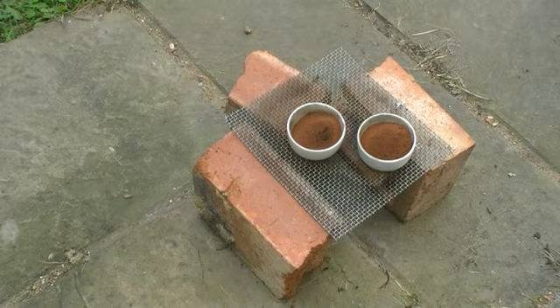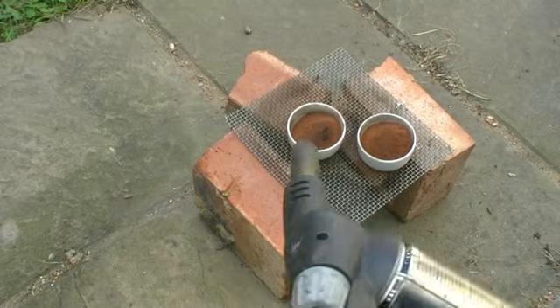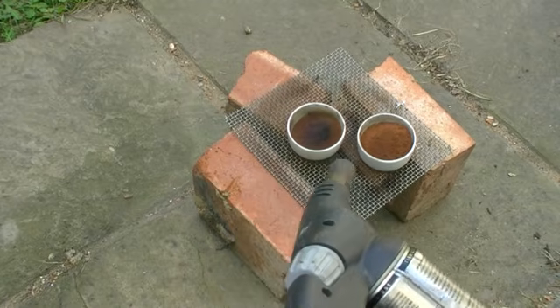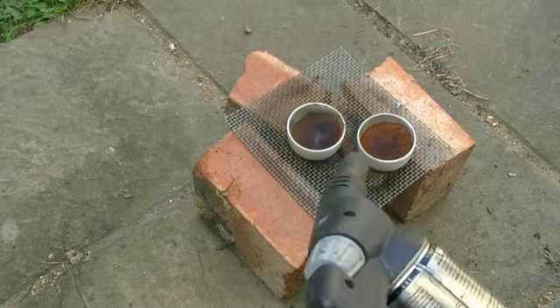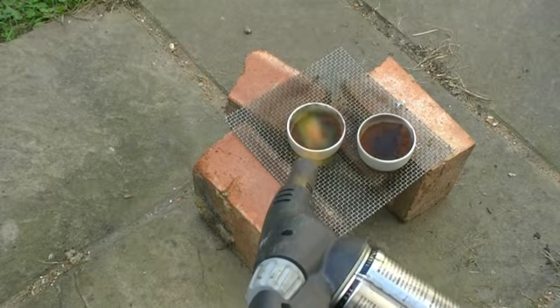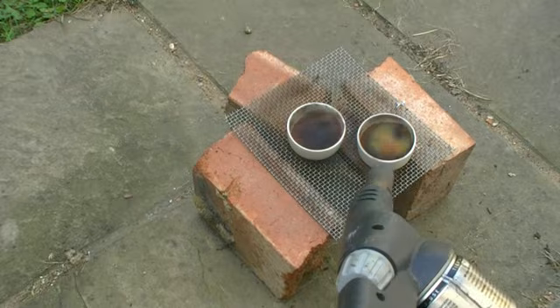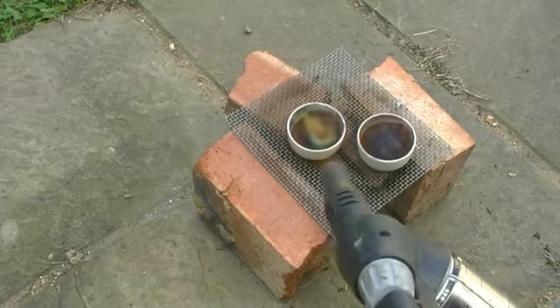We then roast our powder using a gas torch, and over time we'll see our powder go black in colour as it's absorbing oxygen and converting to the highest oxidation state of copper, 2+. If we stir our powder with a stainless steel spoon or spatula, this will help the powder come in contact with air or oxygen.